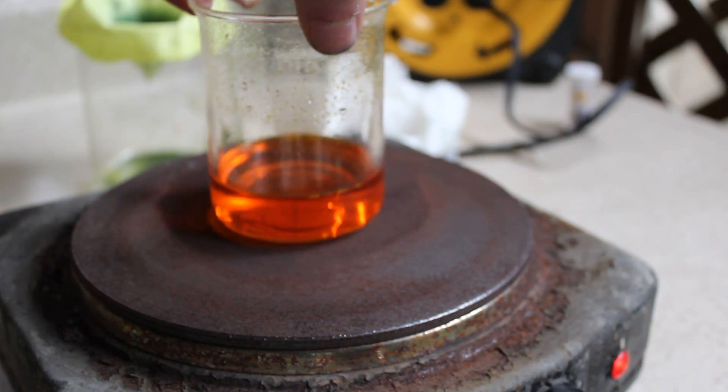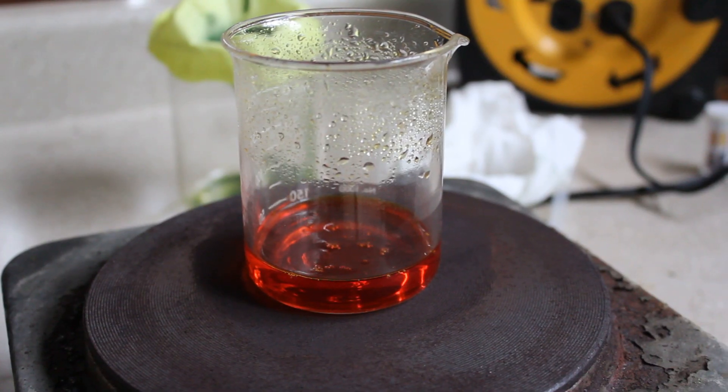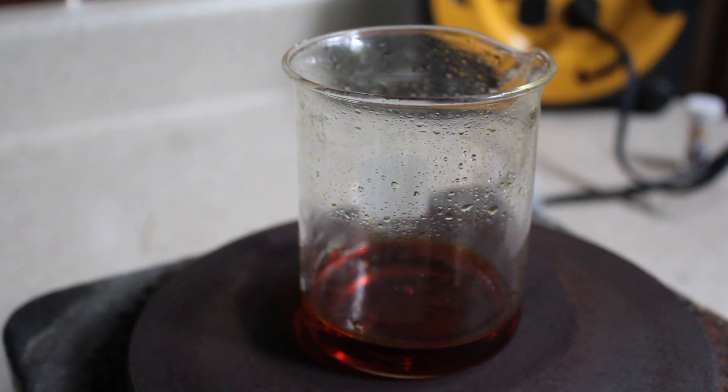I add it to a hot plate so I can start to concentrate the solution down, and as I did so, you can see it get more and more red, and that's just because the amount of dichromate is getting more and more concentrated.